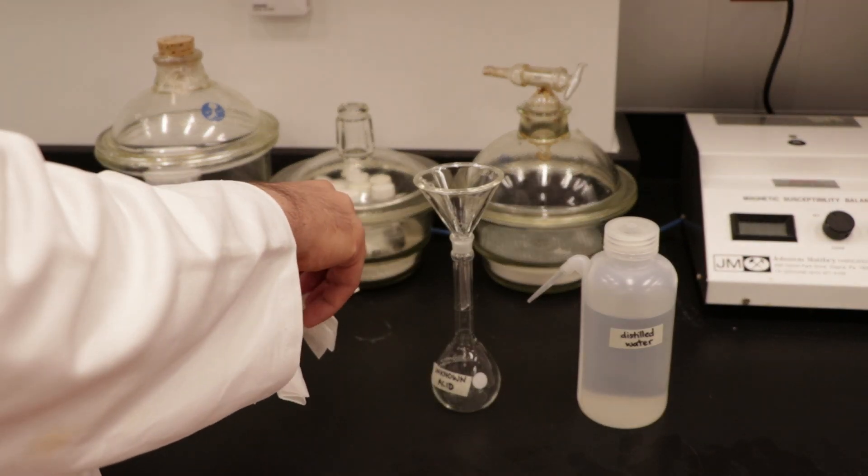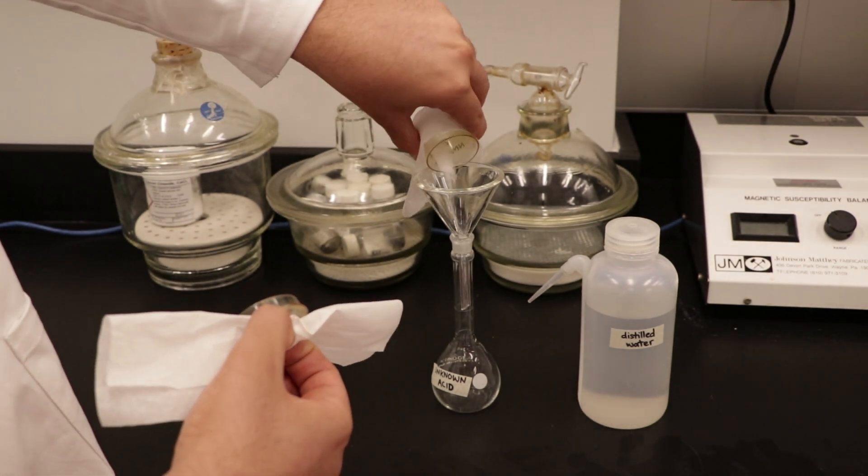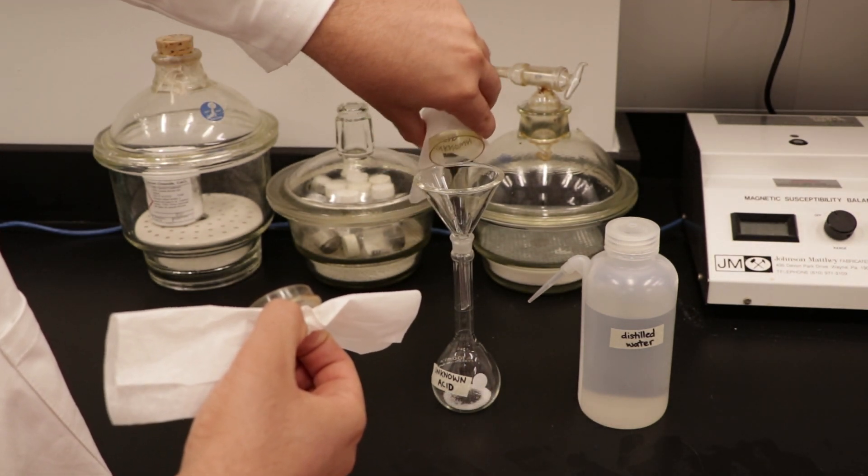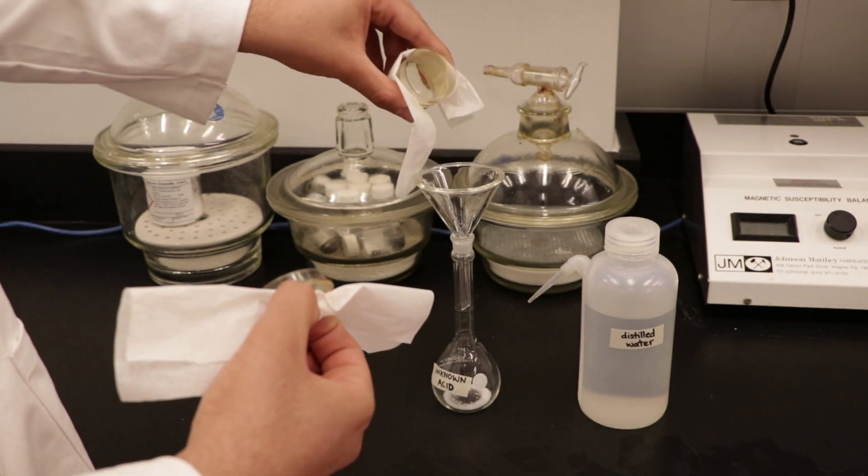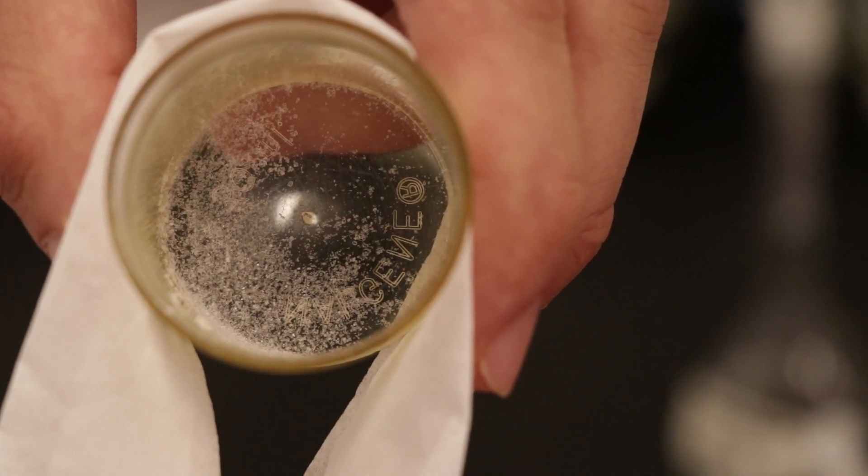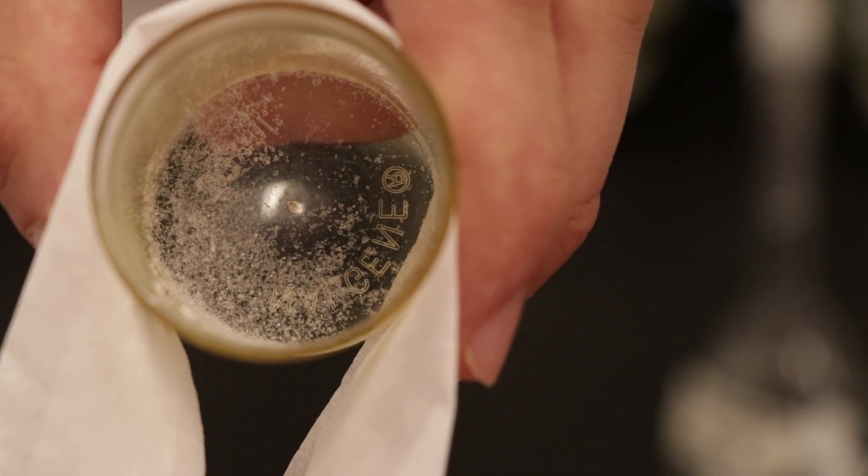Transfer the unknown acid into the volumetric flask. You may notice that not all of the powder will transfer into the flask and this is okay. The important thing is that you know exactly how much acid you have transferred into the volumetric flask.